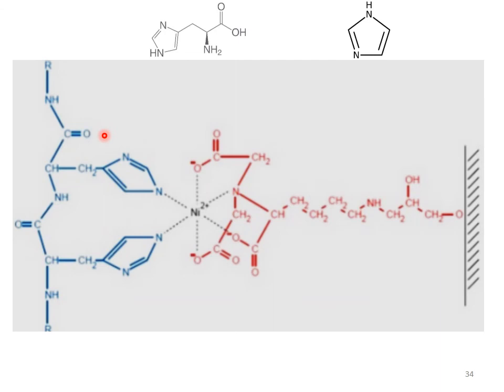In this manner, only the proteins which contain exposed histidines on them would be able to bind to these nickel ions through coordination. Other proteins which do not have exposed histidines on them will not be able to bind to this stationary phase. So in this manner, the histidine tag proteins will have a specific binding affinity to this nickel column, and they will bind to it.